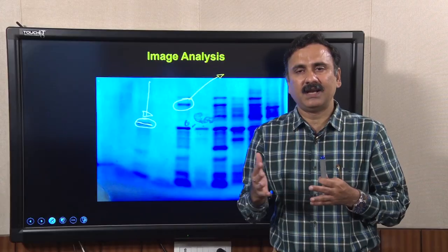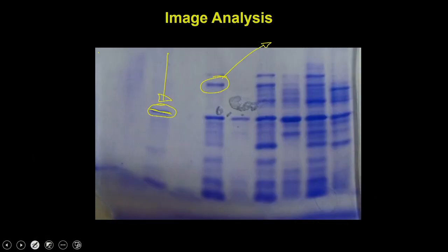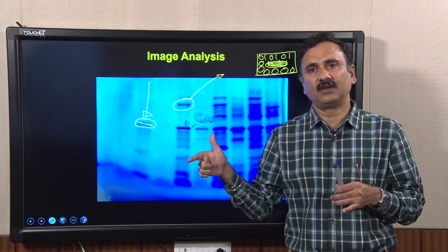a 0-1 format. As a result, for example, suppose this is your band, every spot is going to be converted into a 0-1 approach, which means wherever you do not have intensity, that will be considered as 0, whereas wherever you have the protein band, it is going to be considered as 1 or 10 or 50 or so. That depends on the calibration of the software.